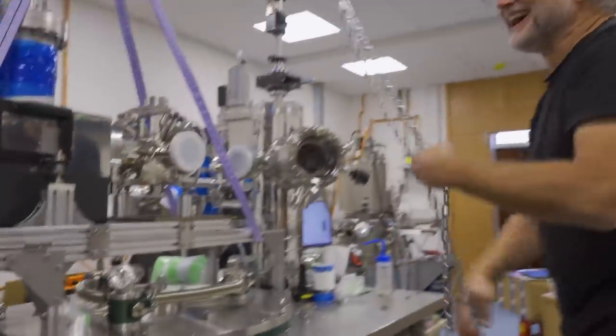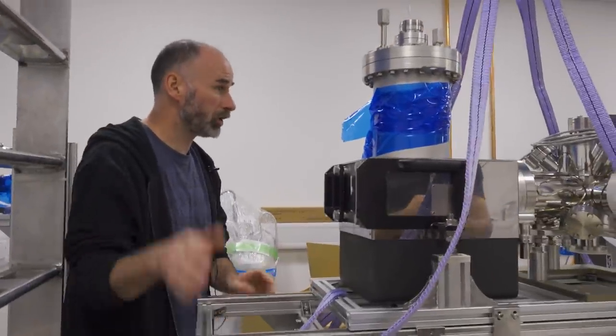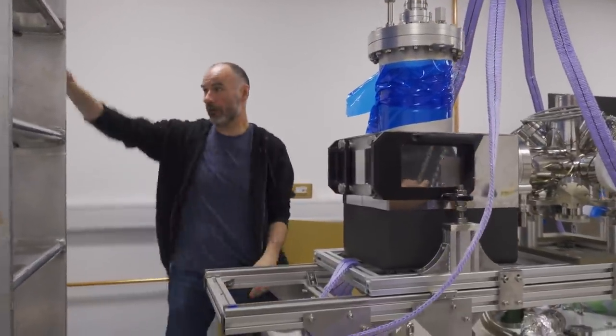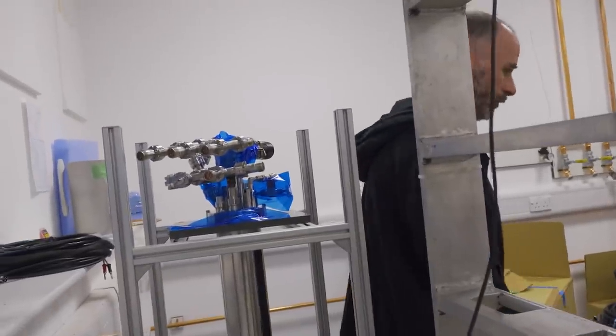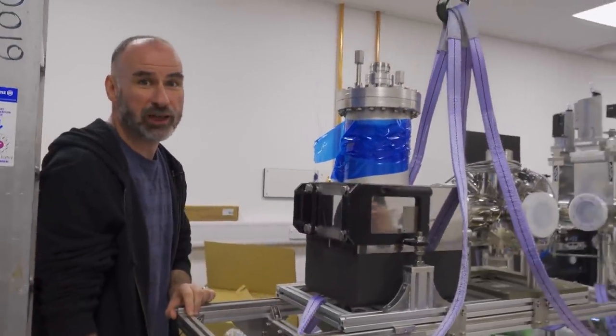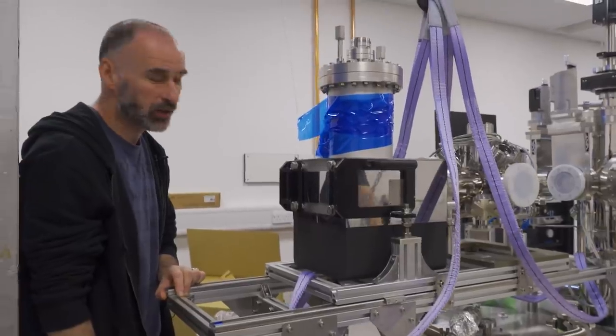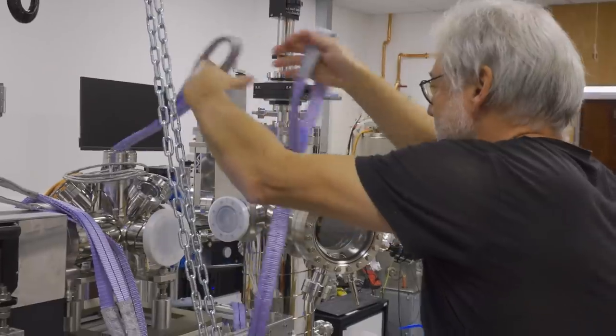Touchdown. Okay, thank you. So we've just craned in this chamber, which ultimately is going to have this thing on top of it going all the way down directly above the magnet, and we're going to see all that come together over the course of the next few days, but it's going to be weeks really, so probably a month before we're going to see atoms.